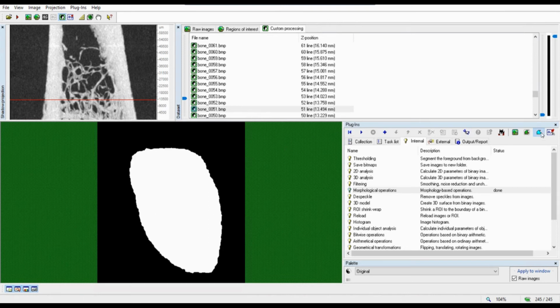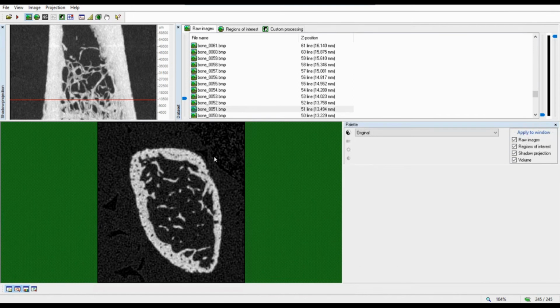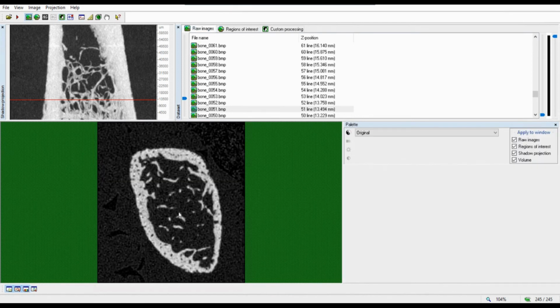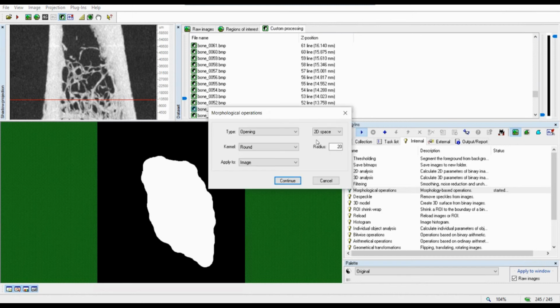Okay, now I have region of interest, I have image. It is always important to check if the border of the region I have here so far is actually inside the bone marrow cavity, because it looks like in this region it is still touching the cortical bone. So that we assure that it's not going to happen, I will make an erosion here, to remove some pixels on the border of my image and make it like 2 or 3.